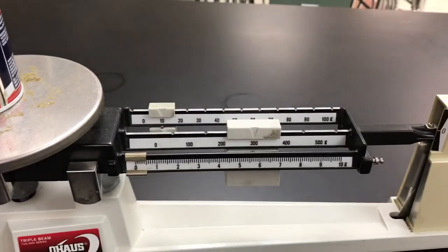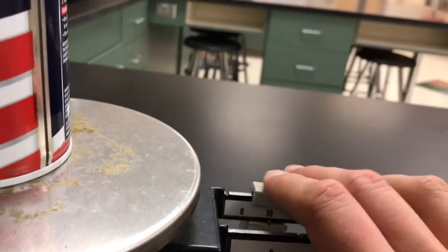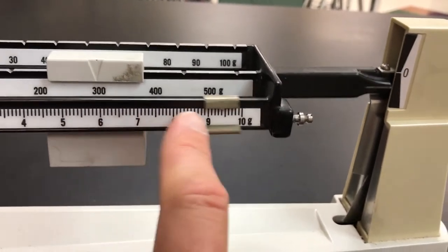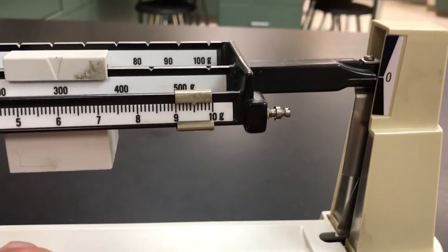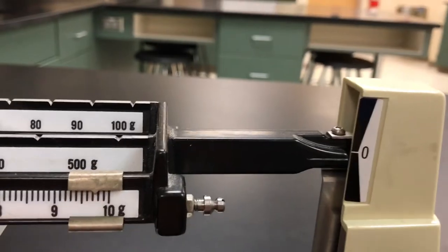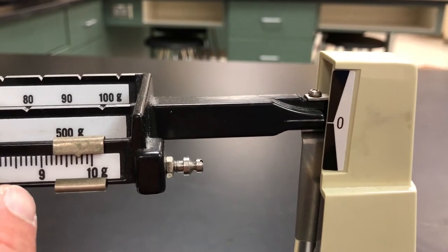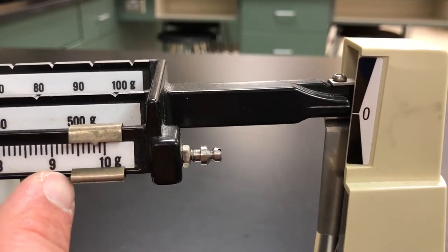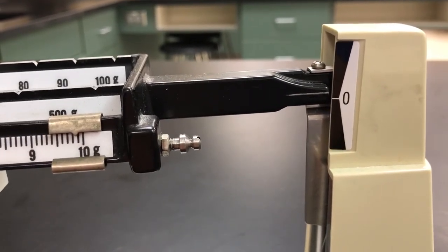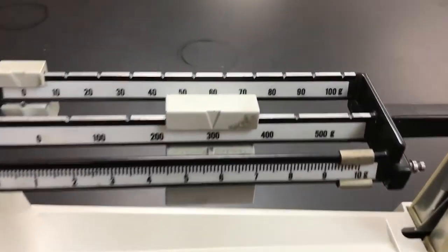On the tens beam, I slide over — it's pretty close but a little too much, so I go back. Then I start with my ones — it's probably fairly close to 10. I slide over and wait for it to settle down. And... bingo!